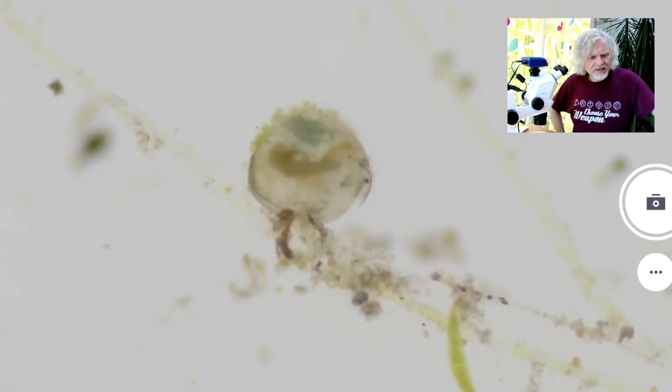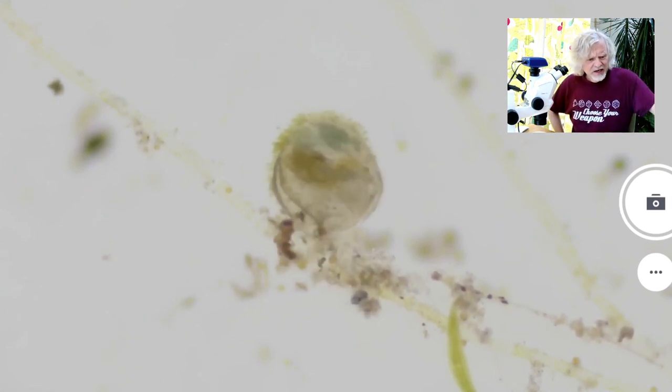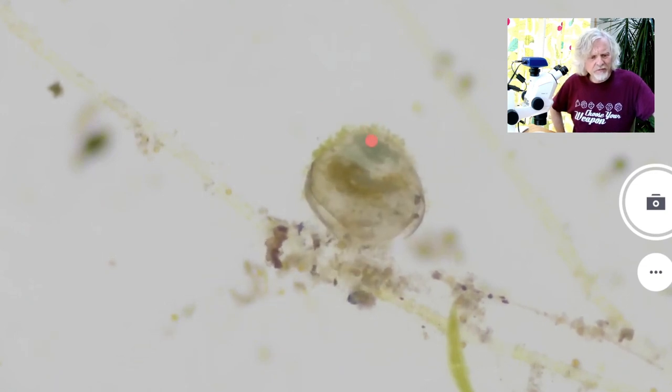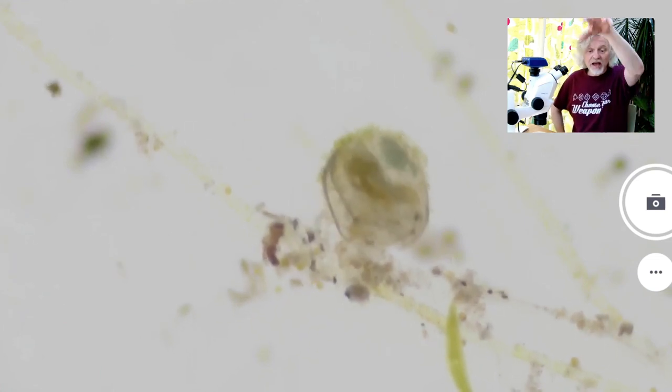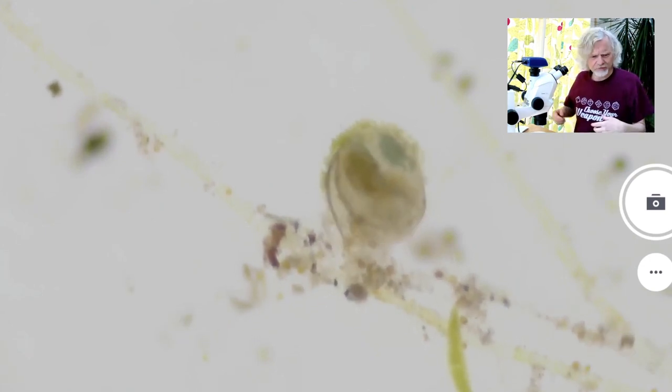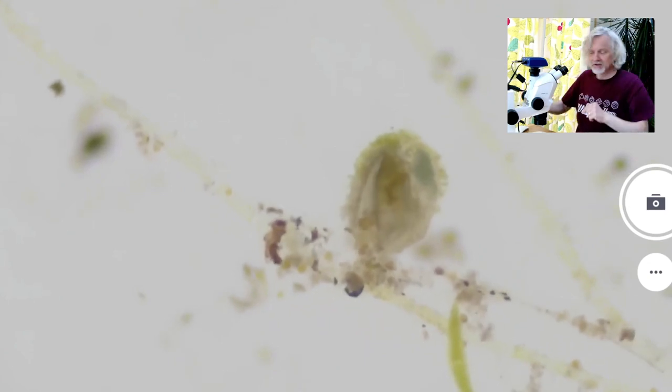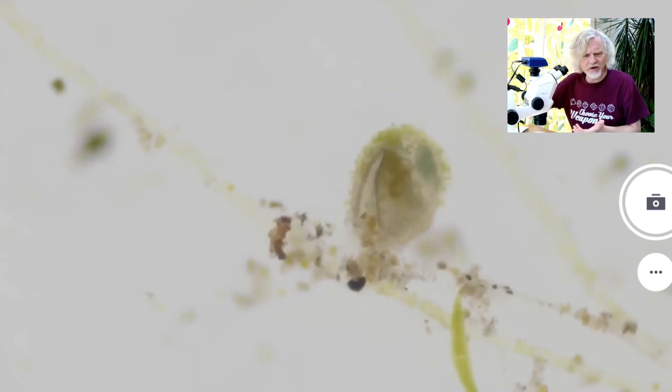And you can see now it's showing us its backside, its bottom. Can you see here? There are two sort of the edges of the shell, and what it does is it keeps the shell a little bit open. And the wiggly bits that you see up here are legs. And what it's doing is it sticks the legs out and it uses that to grab the food. And that's showing us its head. You see these two little dark dots, those eyes. This is the gut here. And then there's some sort of back gut there. And when it wants to move around, what they're doing is they actually use their antennae, which are really long. And they stick them out and they waft those about.